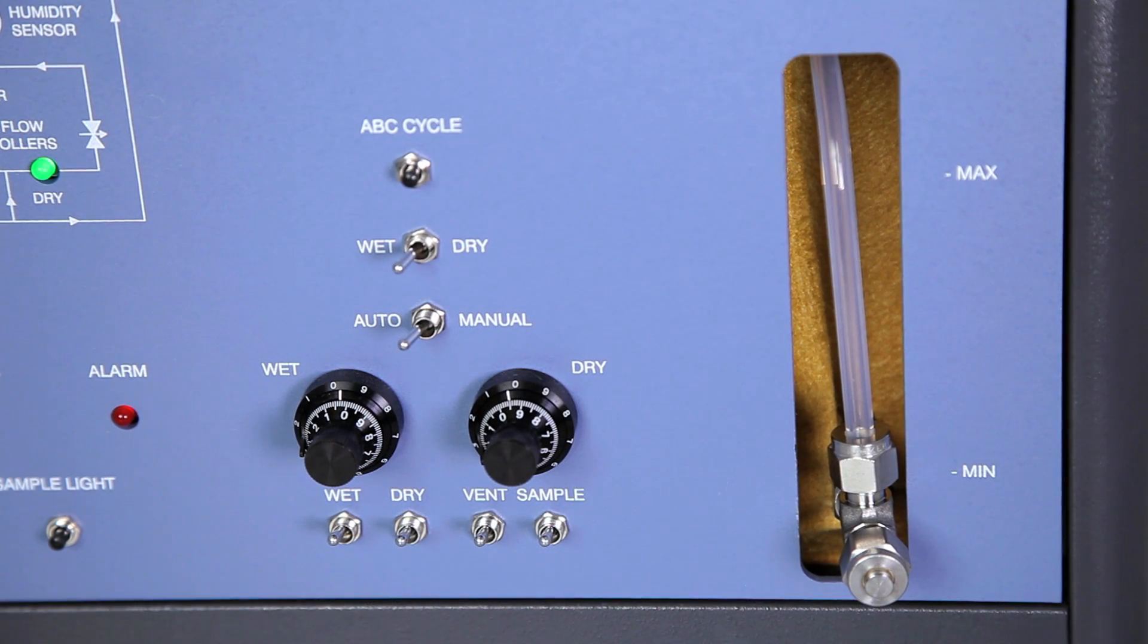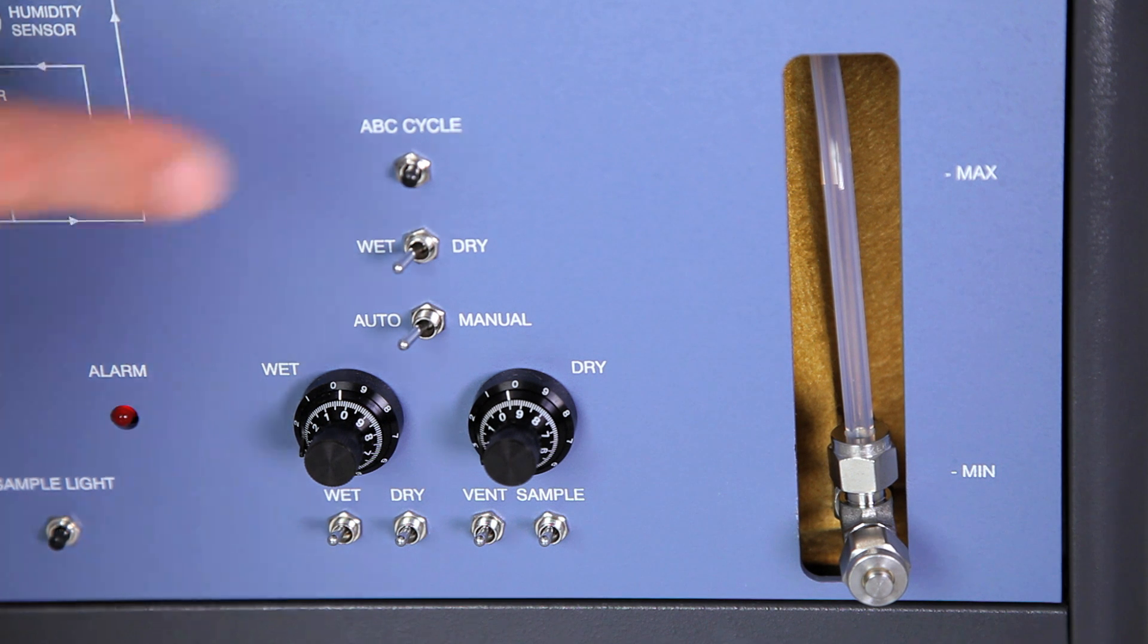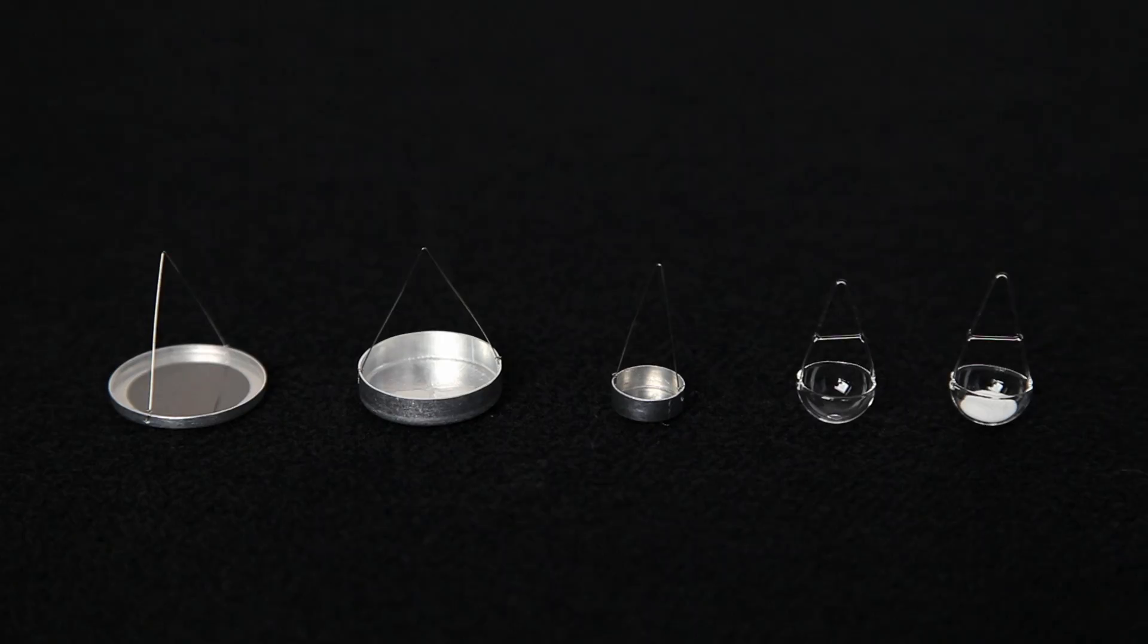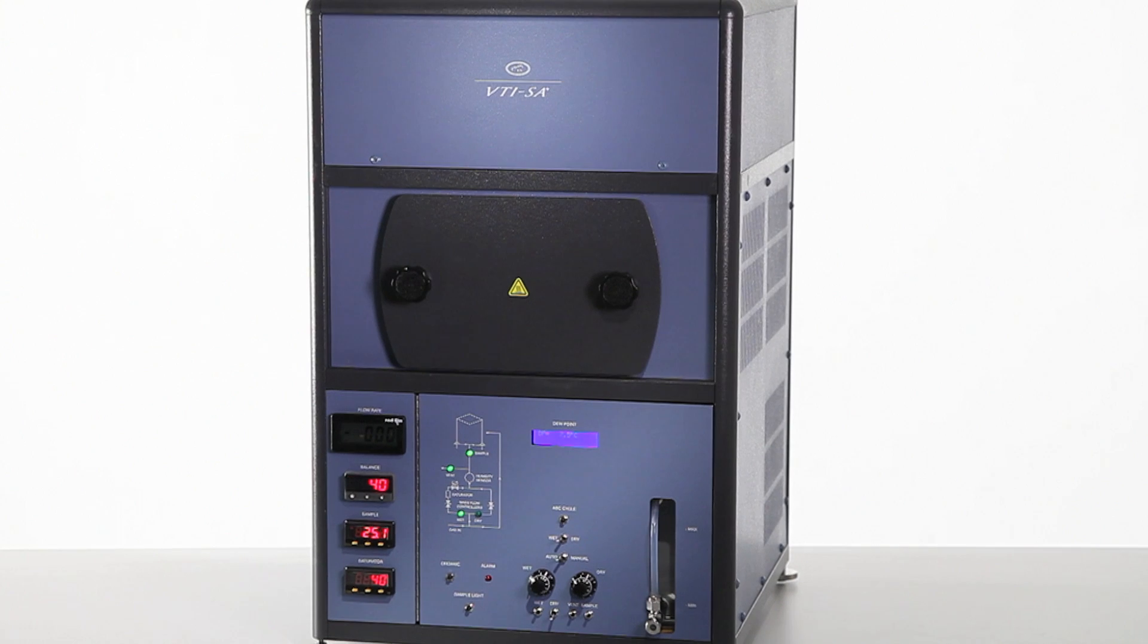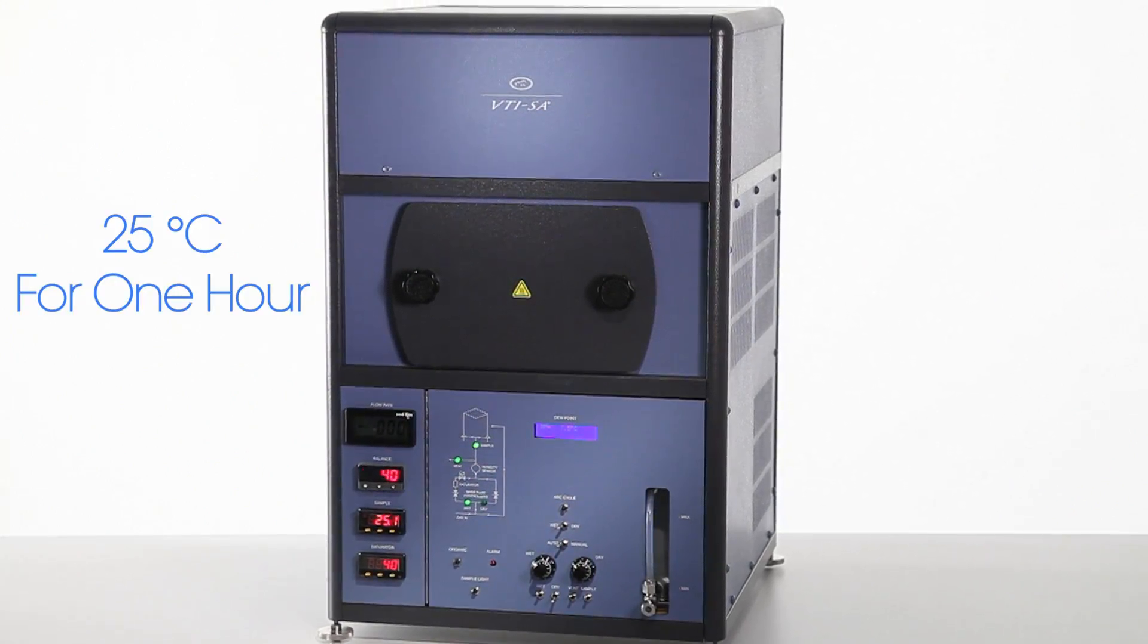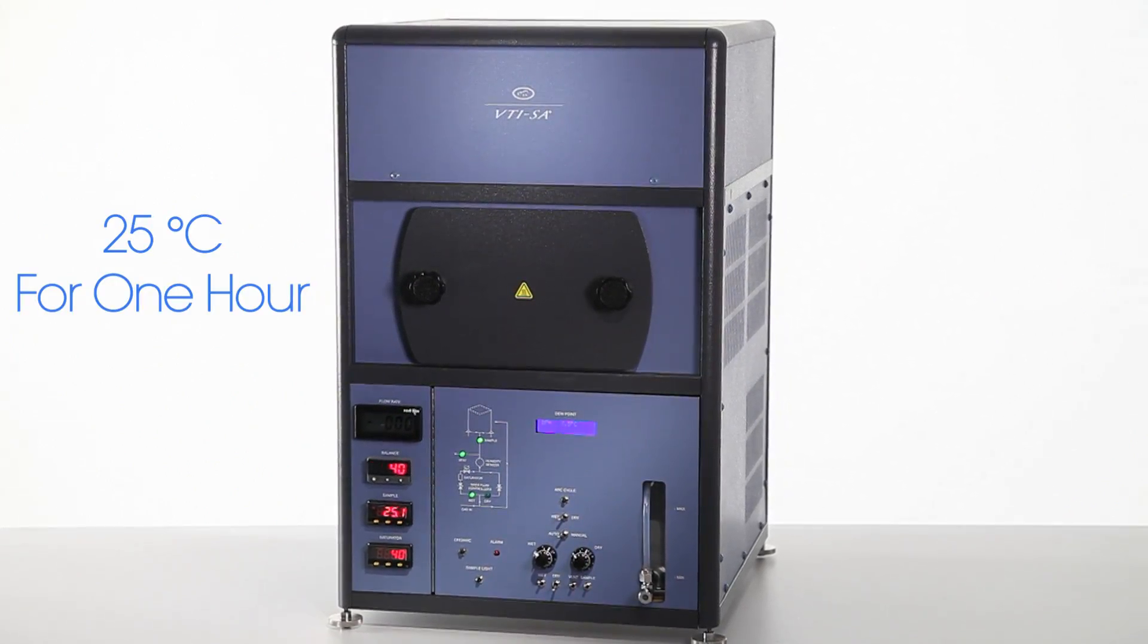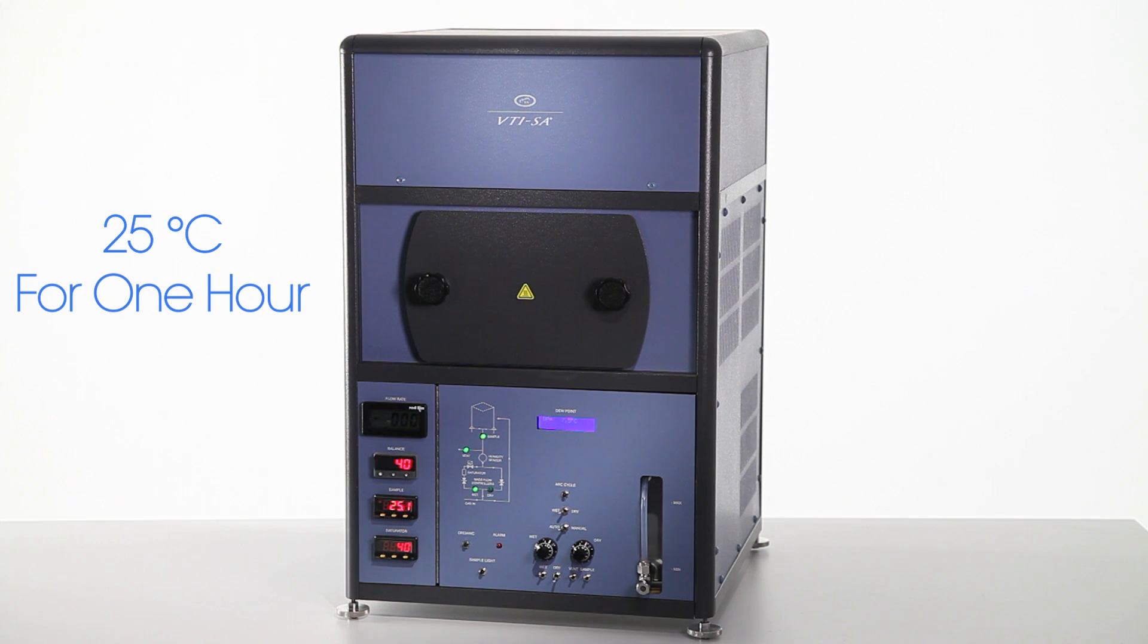First, make sure that the water level in the saturator is adequate and the sample is loaded into a sample pan. Before running a room temperature experiment, ensure the temperature has been stable at 25 degrees Celsius for at least an hour.